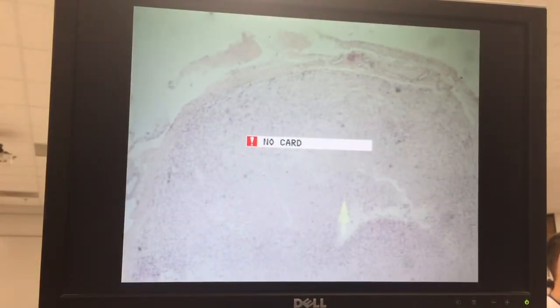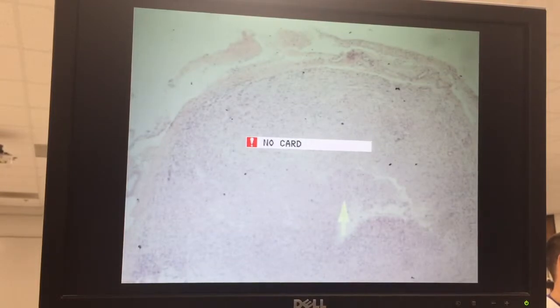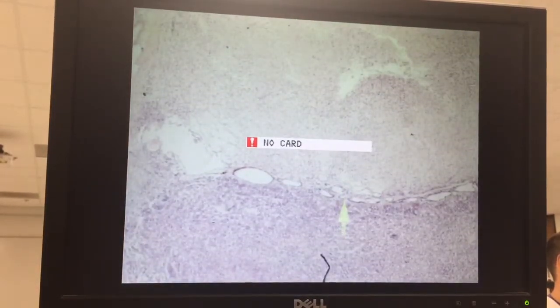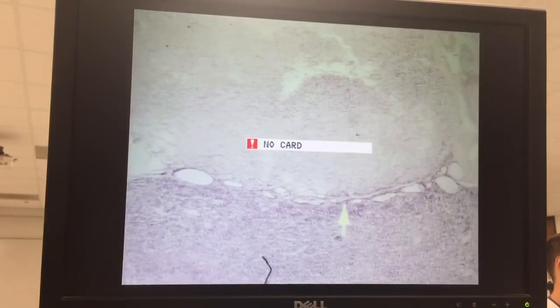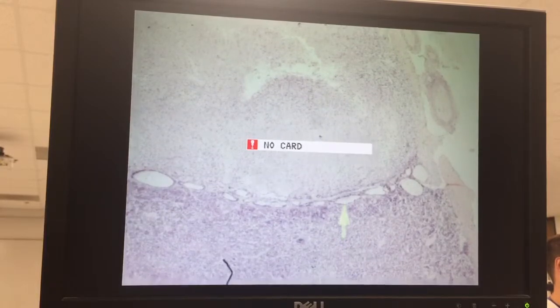This one appears to be a cross-section. There's the neurohypothesis. I can get this into focus. Here's pars intermedia. In fact, you can see those colloid-containing vacuoles and vesicles in there. This is all anterior pituitary.